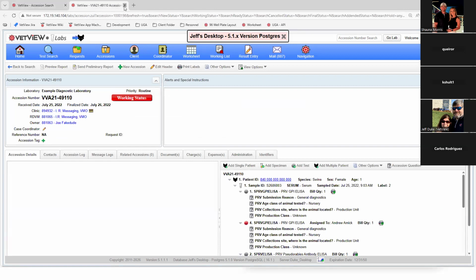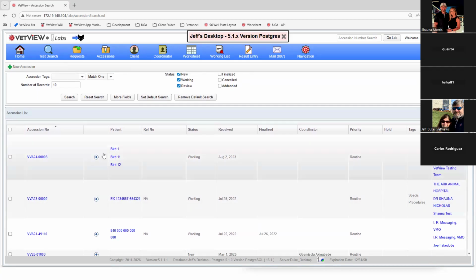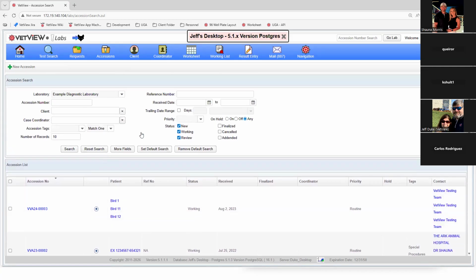It also means that if you have set up a particular search, you're not having to search again and again and again, which can be slow and tedious. So again, control clicking is something I always like to highlight when moving in and out of a system.